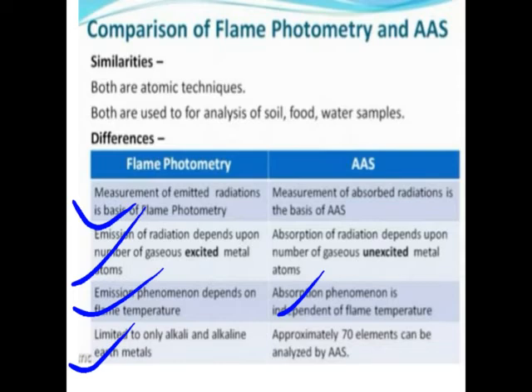So the major difference is the principle, and the major difference is also the applications and the number of elements we can analyze. Everything is different as compared between flame photometry and atomic absorption spectroscopy.